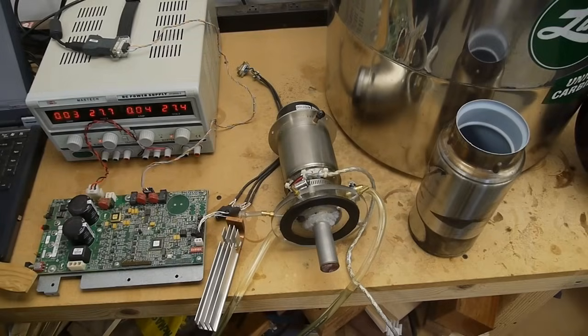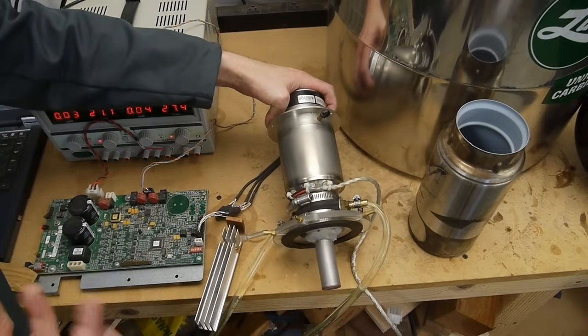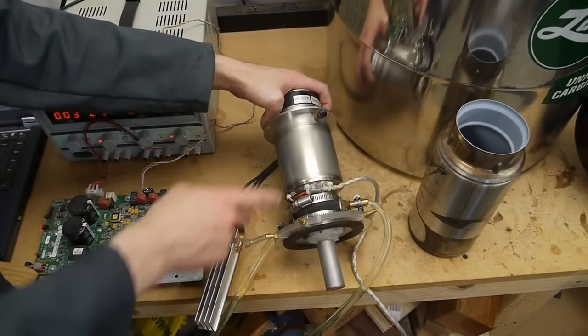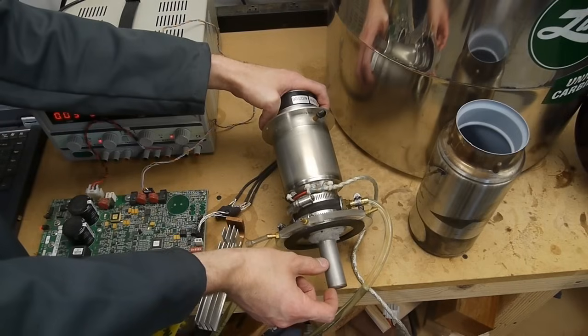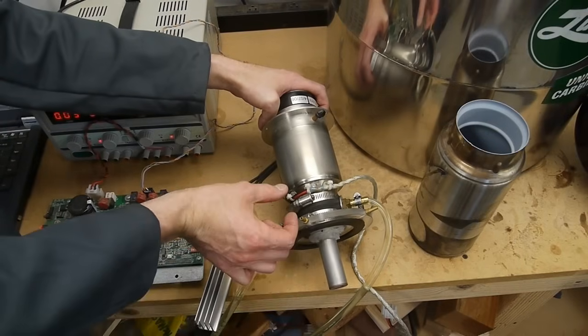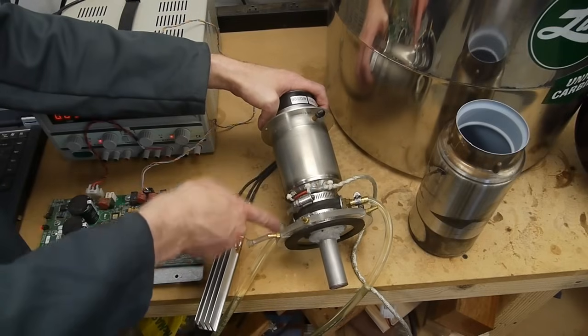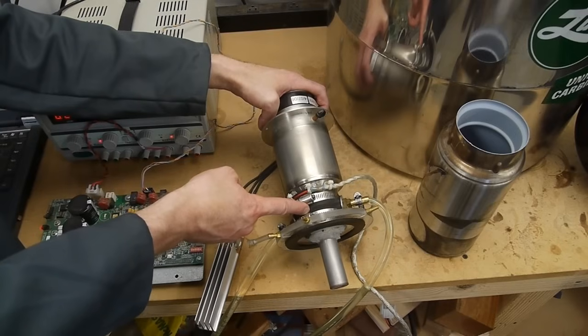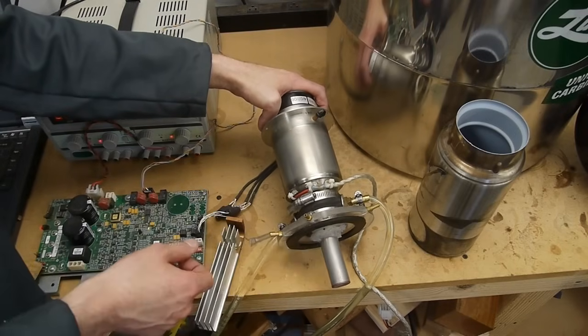This Sterling cycle cryo cooler works on the principle that if you compress a gas it gets warm and if you expand the gas it gets cold. So what it does is it moves working gas which is helium in this case down to the tip of the device where it expands it so the tip gets cold and then it moves that chunk of gas back up to here and compresses it so it gets warm. We can see the water cooling lines here are where the heat is rejected and the tip here is where it gets cold.